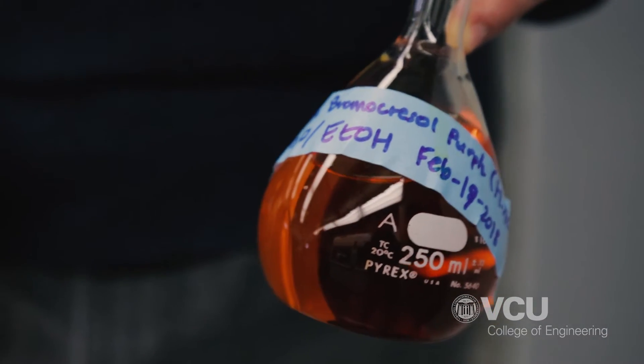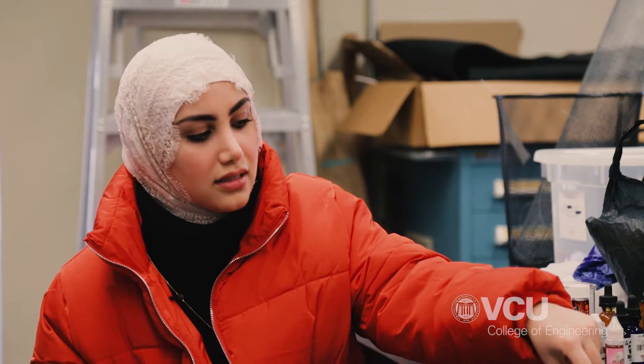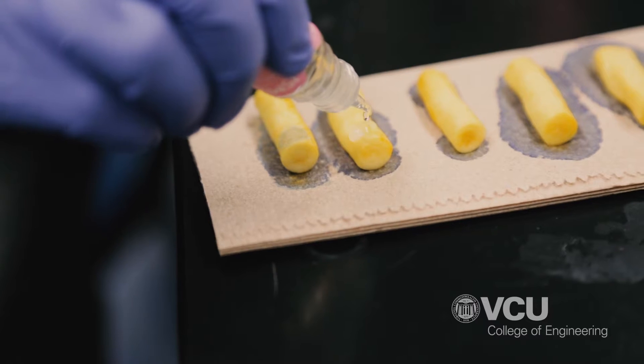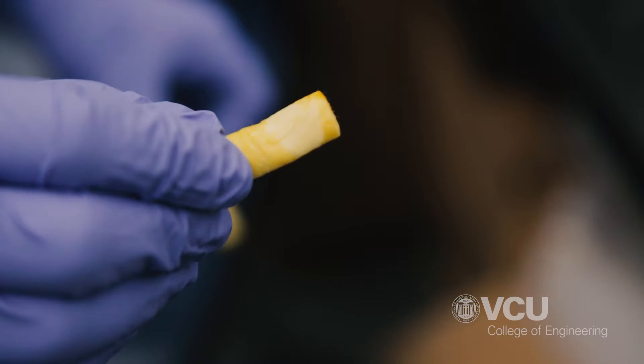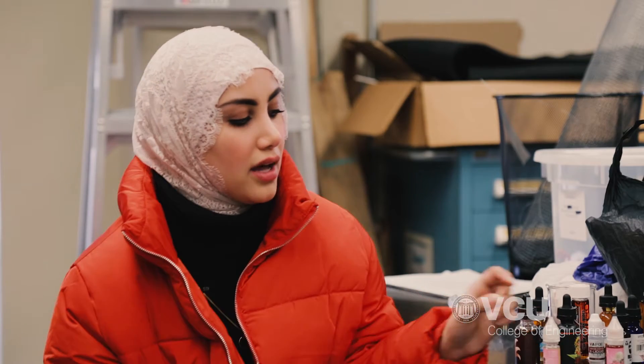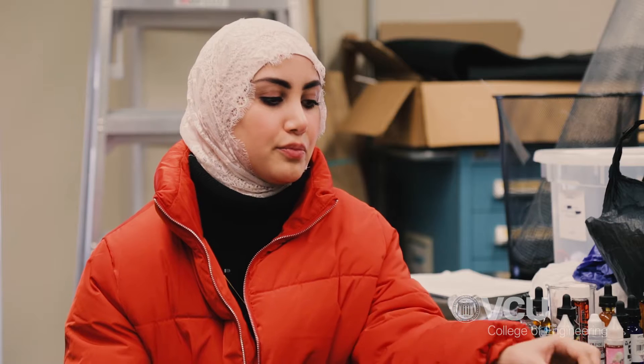The test strips are made of cotton and we use a bromocresyl purple solution, which is a pH indicator that can detect nicotine presence in an e-liquid. If the product doesn't have any nicotine, the test strips will stay yellow — they won't change color. And if the product has nicotine in a high concentration, the test strips will produce a variety of colors based on the concentration of the analyte used.